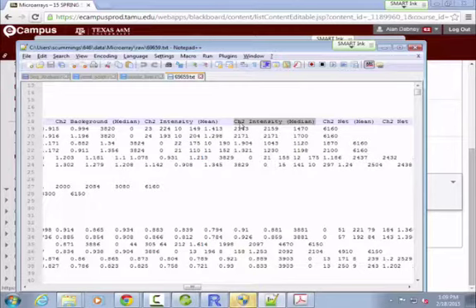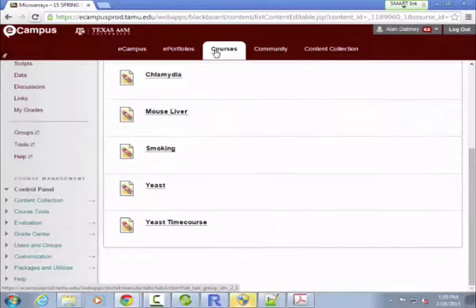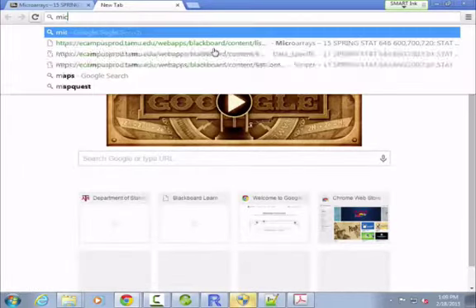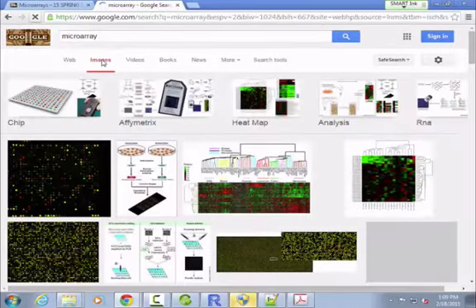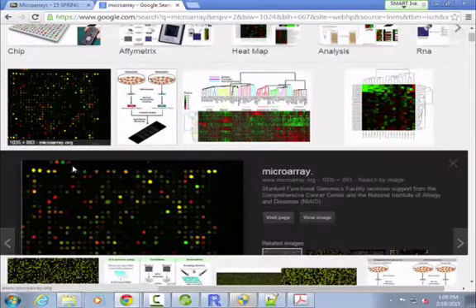So the actual number that I can pull out for this spot is actually lots of numbers, which get quantified as pixels. This is a snapshot, an actual image of these microarrays. I don't know if I've shown you this picture before, but it looks like this kind of thing.